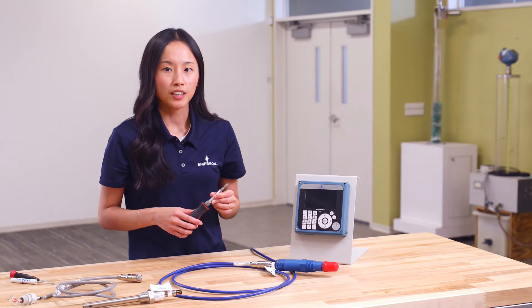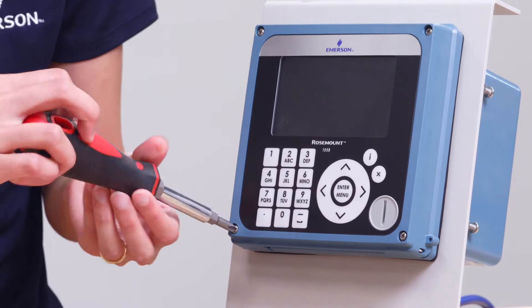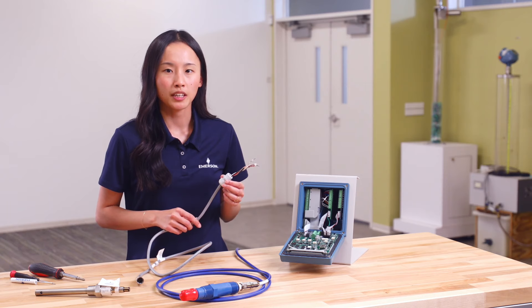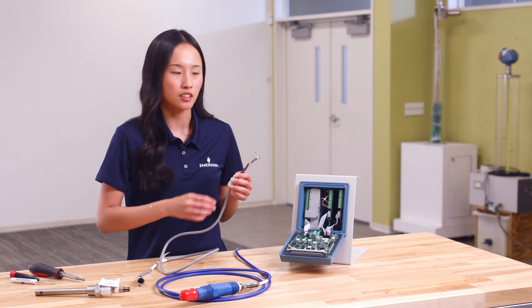Once again, remove the cover of the transmitter by removing the four screws. Thread the ends of the wires through an appropriate cable gland, which I have already done, and install the cable gland into the transmitter.